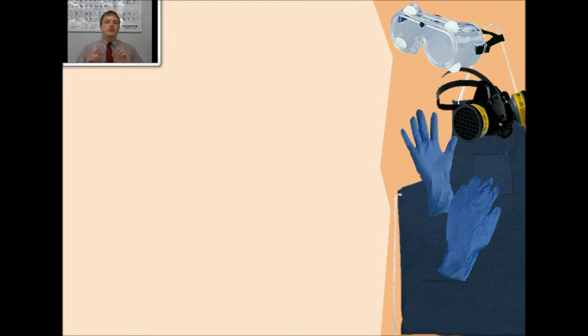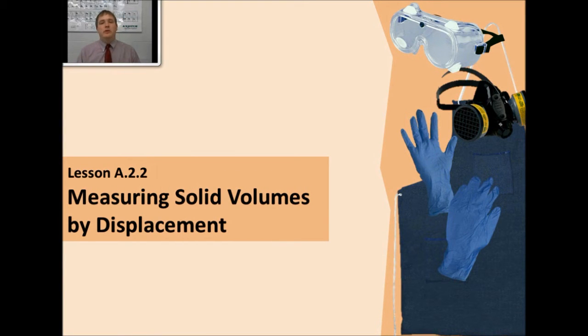In the previous video, I showed you how to directly measure a liquid volume using a graduated cylinder. How you can pour the liquid in and just measure the mark to which the liquid reaches and round off to the nearest tenth. In this video, I'm going to show you something similar but different. I'm going to show you how to measure the volumes of irregular objects still using this graduated cylinder, but this time using a technique known as volume by displacement. How do you measure irregular solids by water displacement?